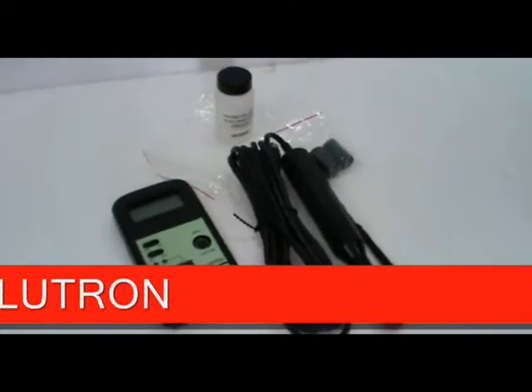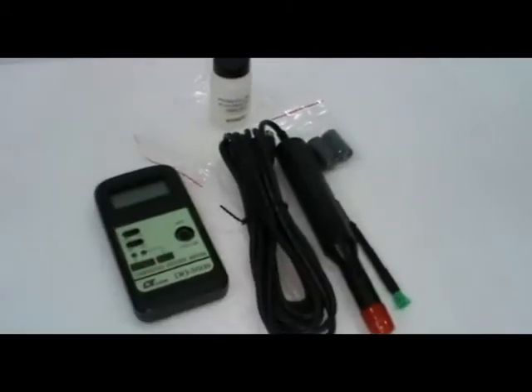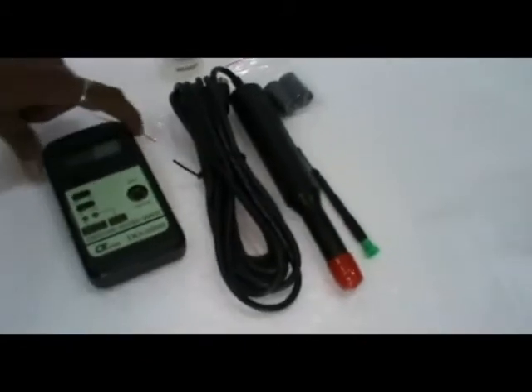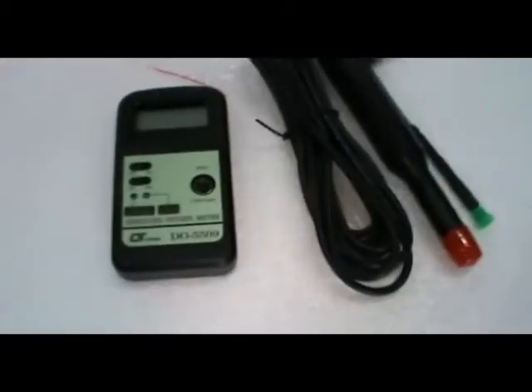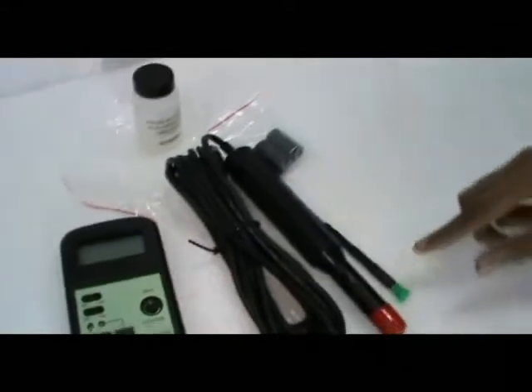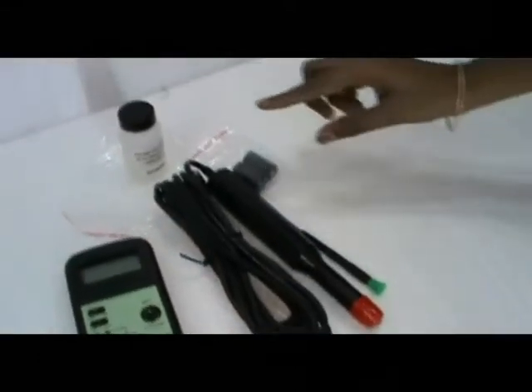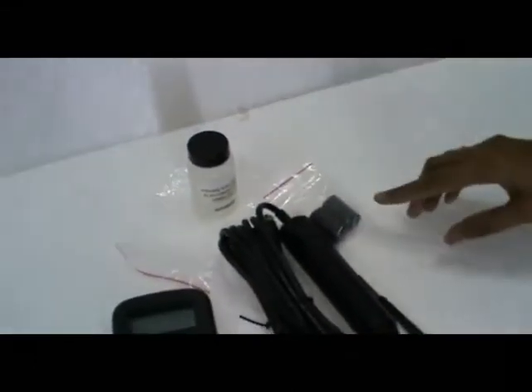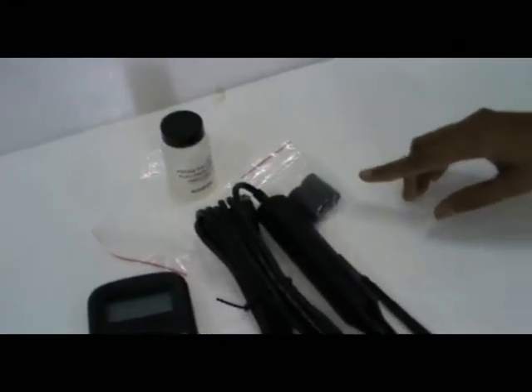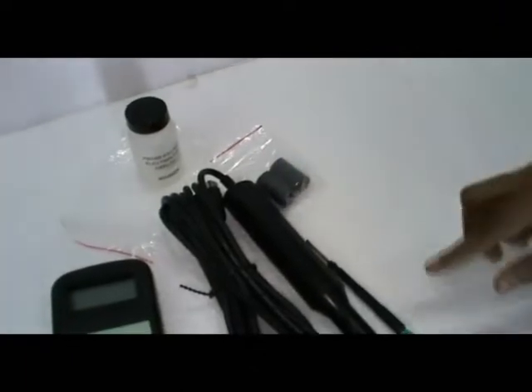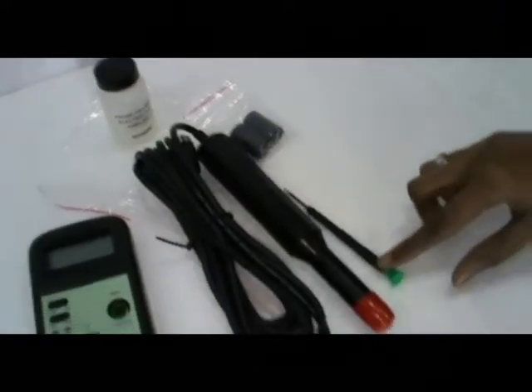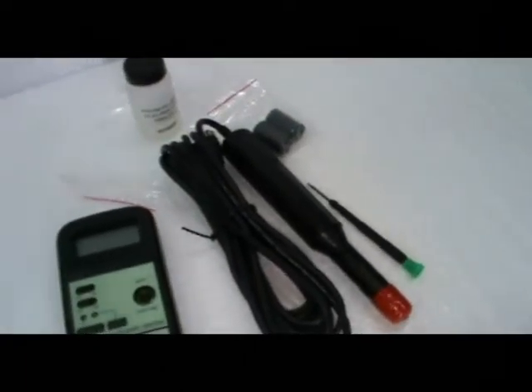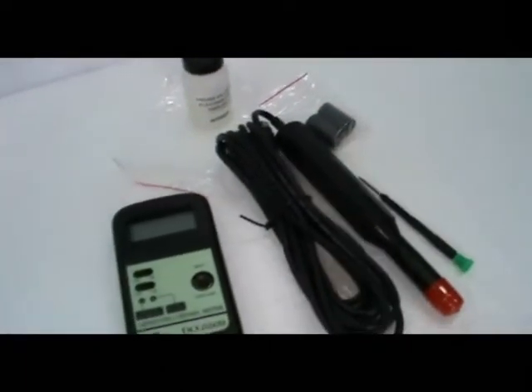Demonstration for DO meter model 5509. Accessories include probe, electrolyte solution, membrane, calibration screwdriver, and instruction manual.